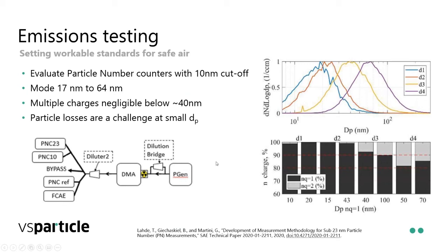And what you see is such a setup typically looks like you have a particle generator. You may want to dilute the flow coming out of this, if you have too many particles coming in, then you go through a differential mobility analyzer. In this case, they use the neutralizer. We don't recommend it. We don't disrecommend it. In our experience, we get slightly lower charge distributions, slightly lower charge concentrations with the G1 compared to a neutralizer.